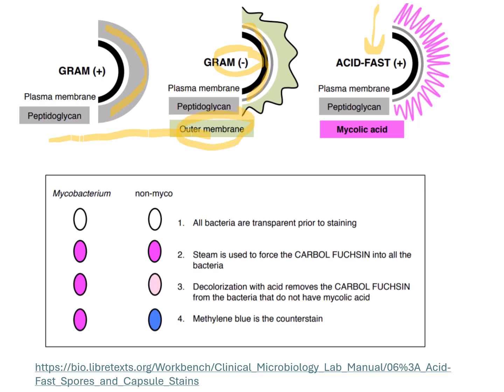Acid-fast bacteria, remember, are also gram-positive, so I don't really like this part that much because it should be a thick layer, but it shows nicely the outer layer of mycolic acid. And here are the steps again.